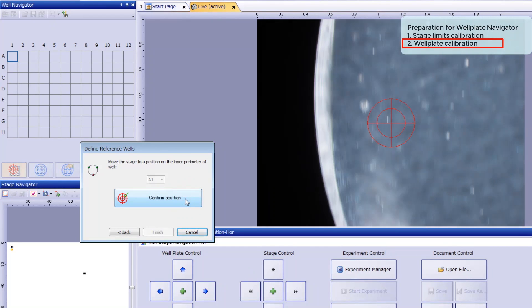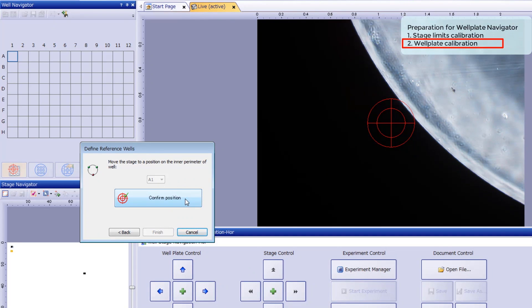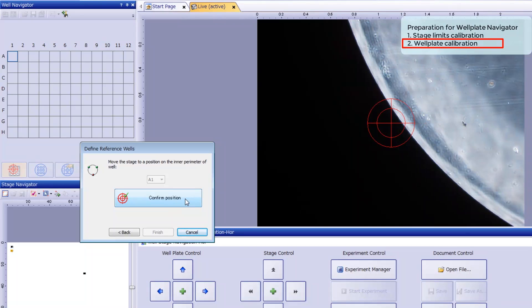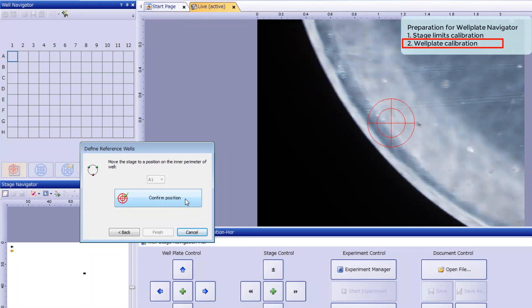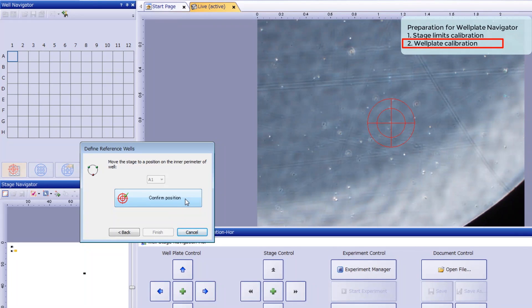Then drive the stage to another edge of well A1 and click Confirm Position. Do this a third time so that all three positions are registered in well A1.